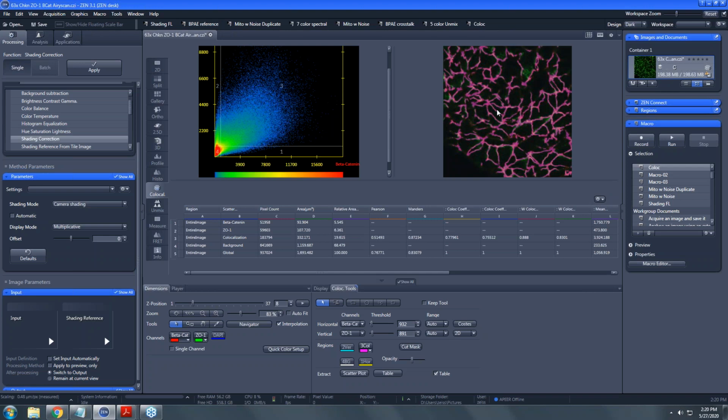So consider for example, I look at a single cell that has cytoplasmic GFP and cytoplasmic RFP. There's no associated protein. There's just the two fluorophores free floating. They're going to be coincident. They're in the cytoplasm, so the entire cytoplasm will show colocalization. There's no biological significance to that. There's no binding, but you'll get a very good correlation between the two.